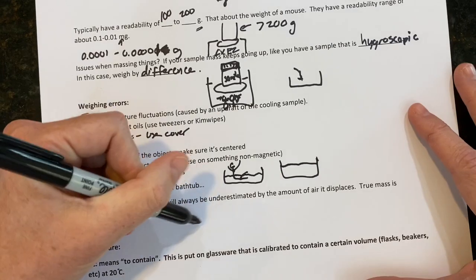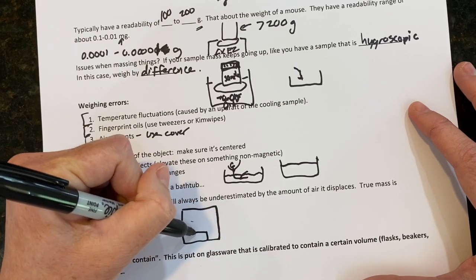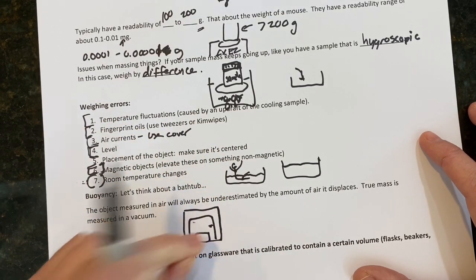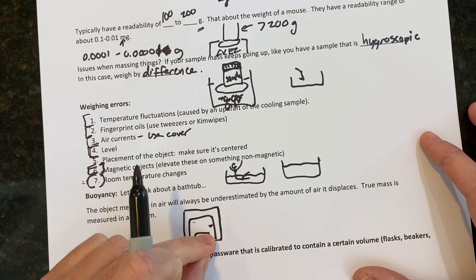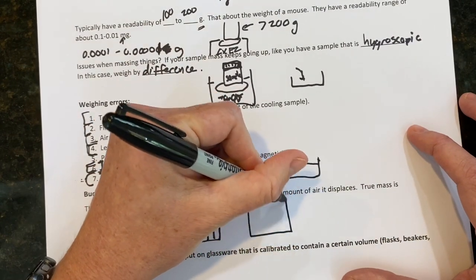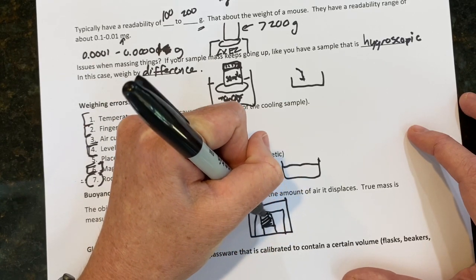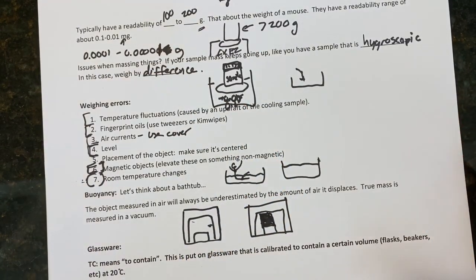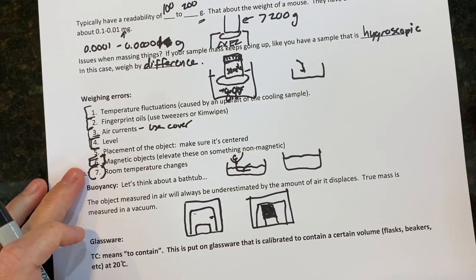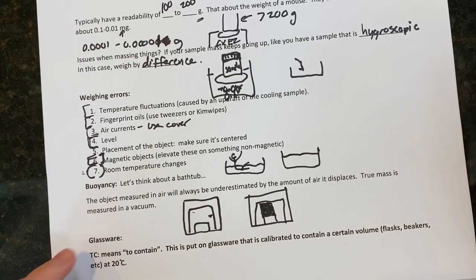So get this, when you calibrate a balance, I'm going to draw it now like this because oftentimes the balance will be inside a cage like we talked about. It'll have a door on it. So this will be like the little door, and you open the door and you put the sample right in there. Now, when you calibrate a balance, there's all this air in there, right? But when you go to put a sample in that you want to measure, it's whatever this beaker thing is, what happens is now you've displaced the air that was in there when you originally calibrated it. So you're actually underestimating the mass of this thing because you've displaced the air that was originally in there.